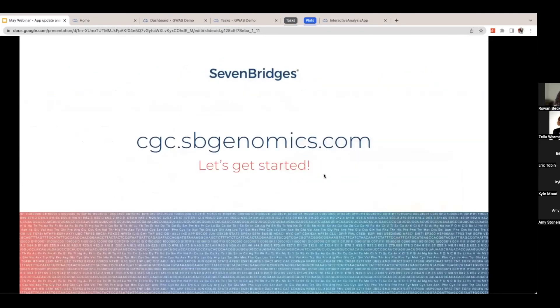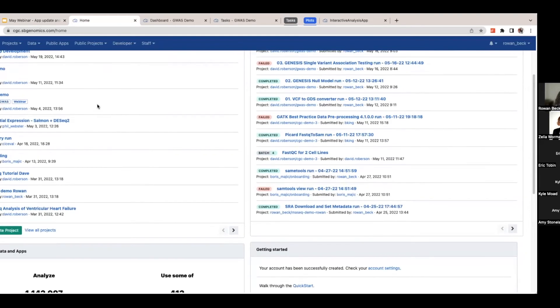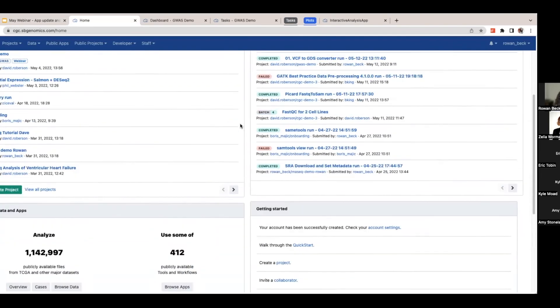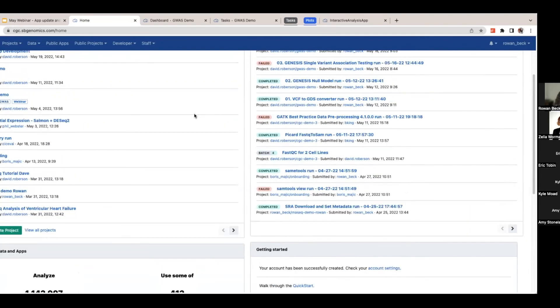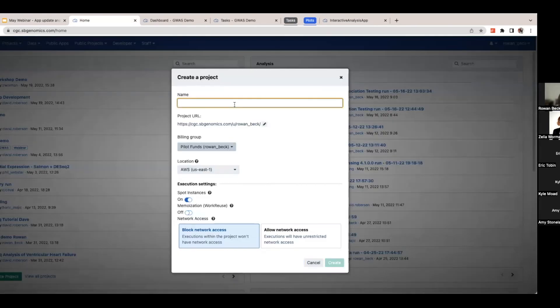Once you log in, you'll see the homepage with a list of projects on the left and analyses run on the right. To start, click Projects and create a project. You can give it a name — I'll do GWAS demo May webinar. You can scroll down and choose how to pay. I'm using my pilot funds. Keep in mind anyone who signs up with the CGC will get $300 worth of pilot credits, which is more than enough to at least start with. Then click Create and you'll be taken to your new project.